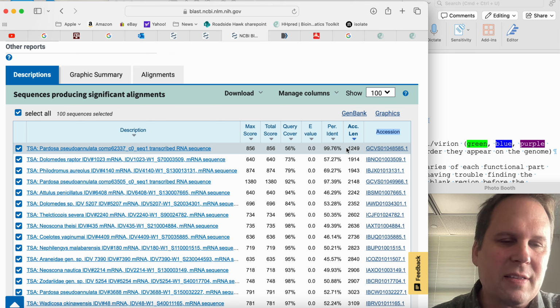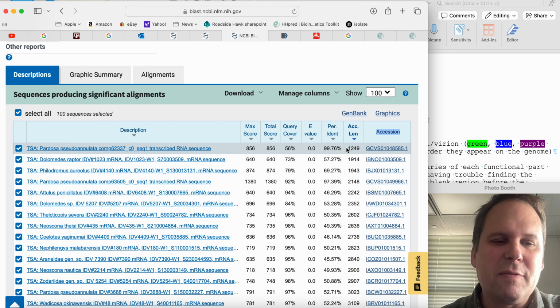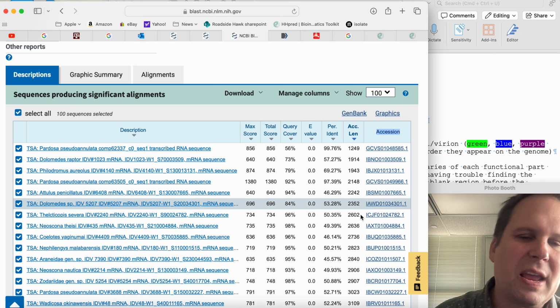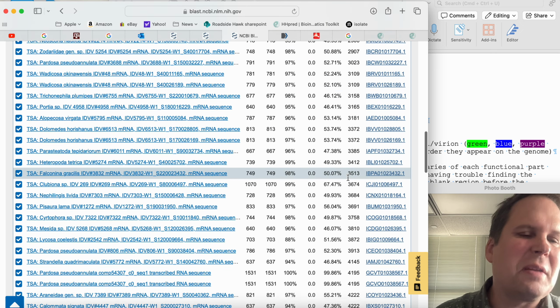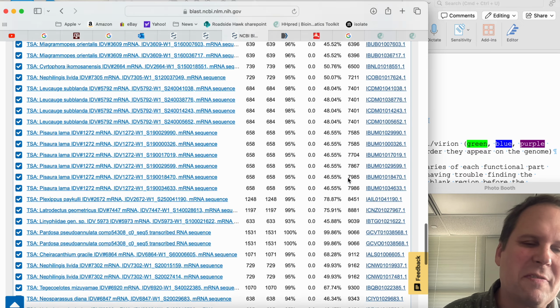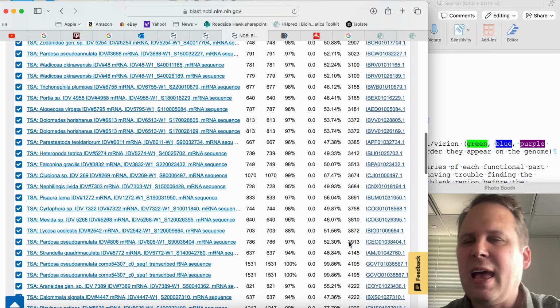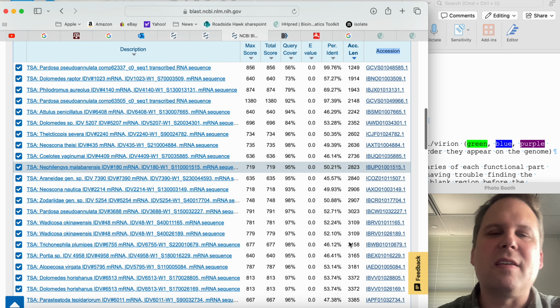And so this tells you how long the thing was. A full-length virus of the type we're looking for is going to be in the 8,000 to maybe 12, 13,000 range. And so these little guys, those are going to be partial viruses. We don't want to work with fragments today, just because I want you to find a nice complete thing. So you picked something that was 8,000 or bigger, I would say. And that's great. Okay, what else is on here?